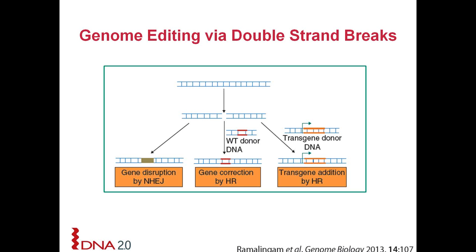In the yeast system, we have selection for the plasmid, so you can either leave that selection on or off, and then you would keep the plasmid and retain it, or eventually use it.